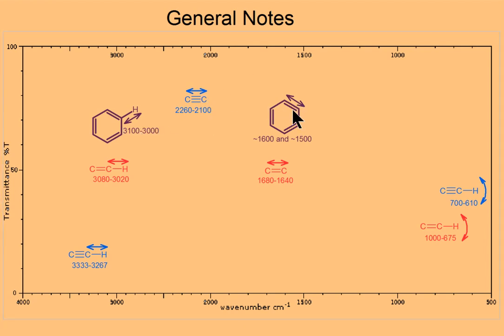After the alkynes, related are the aromatics with sp2 hybridization around the carbon ring. The carbon to carbon bond itself in the ring sometimes has a peak at about 1600 and often a peak round about 1500, give or take a couple of units, and sometimes a third peak about 1400. Sometimes all of them appear, sometimes only one or two of them appear. Most commonly, the 1600 peak appears, and it's weak to moderate in strength. We often get the CH stretching overtones between 2000 and about 1600. Looks like a kind of bumpy baseline if it's present, but again, it isn't always present for the aromatic.